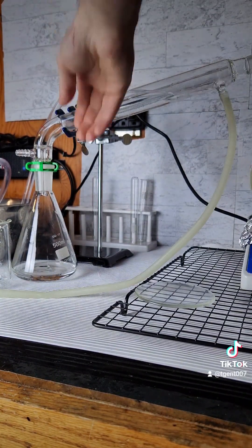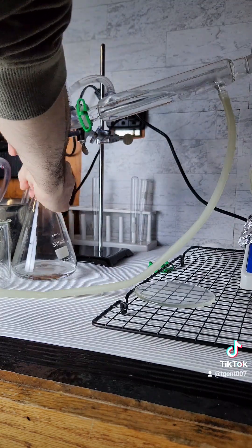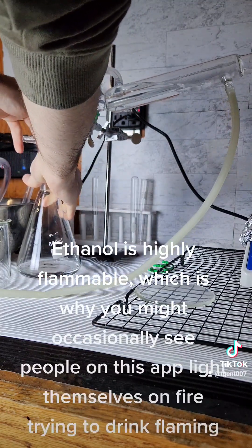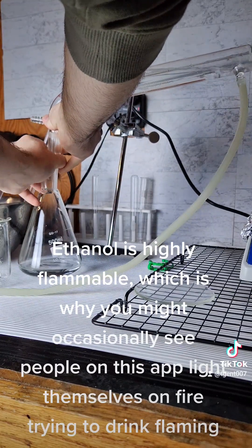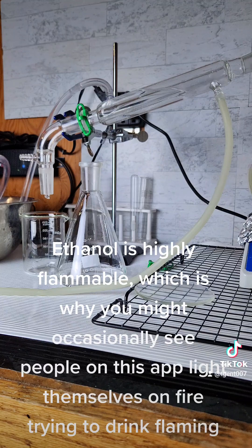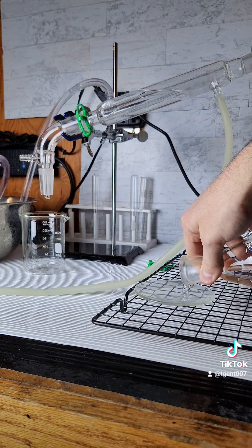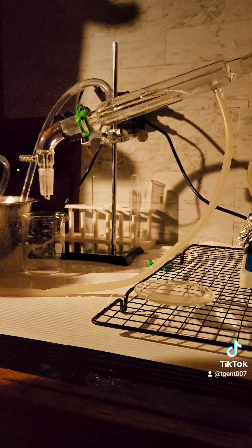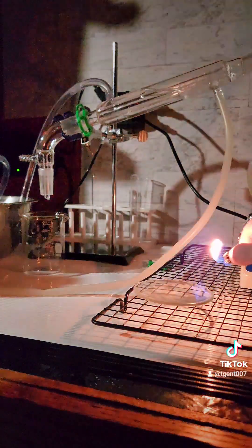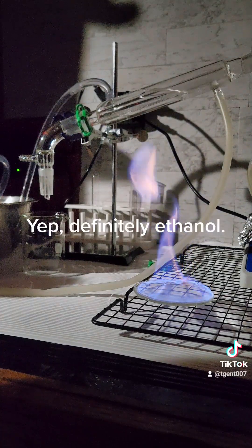Finally, to show that what I've made here is truly ethanol, I am going to light it on fire. Ethanol is highly flammable, which is why you might occasionally see people light themselves on fire trying to drink flaming shots. Yep, definitely ethanol.